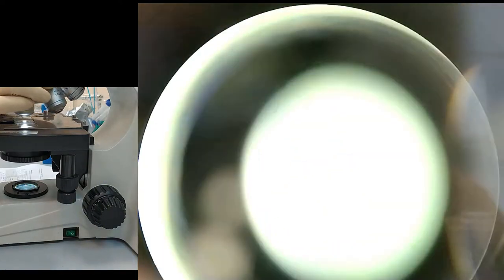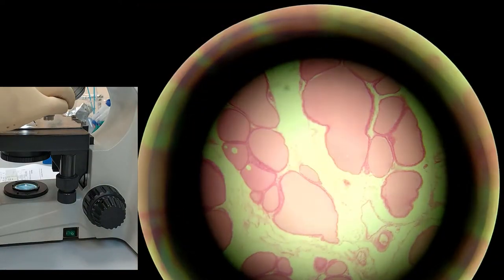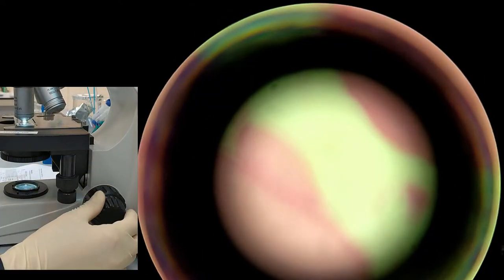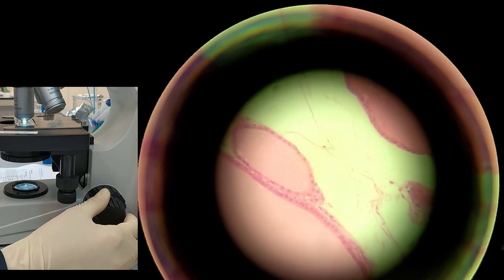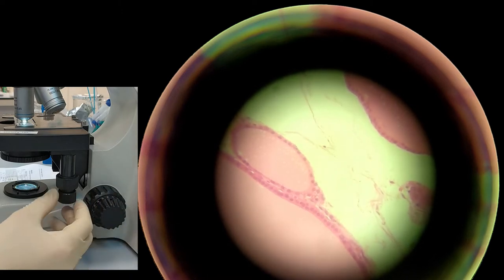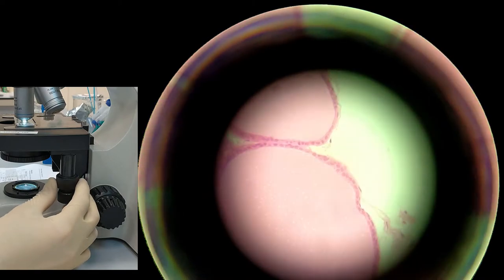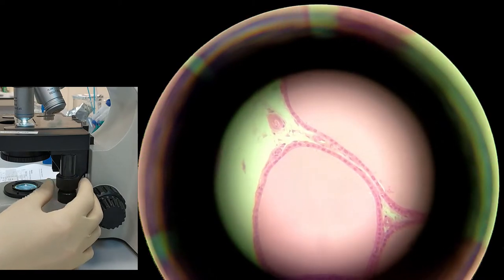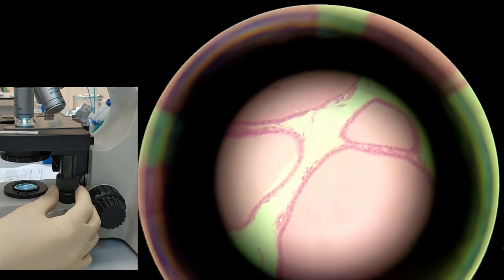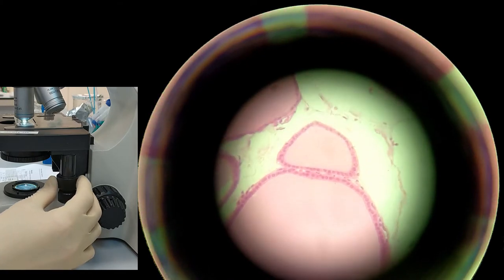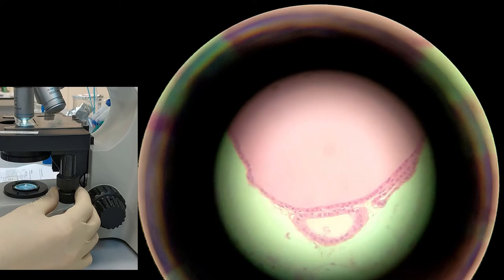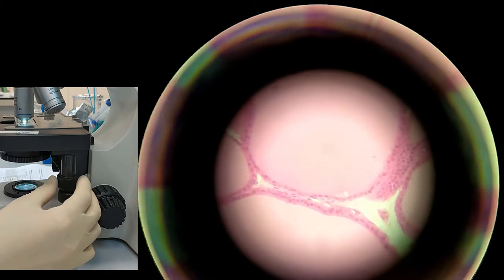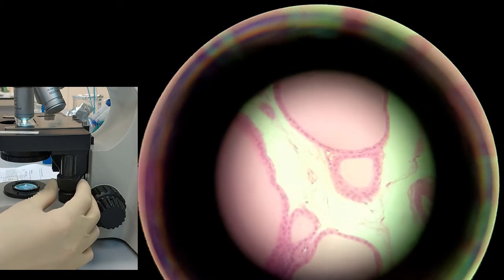Now we can switch to 10x or 40x to see the details. Here you can see that these big voids, they are actually surrounded by epithelial tissue, and it is called cuboidal because every cell here is cubic. Again when you find the best view you can start drawing it.